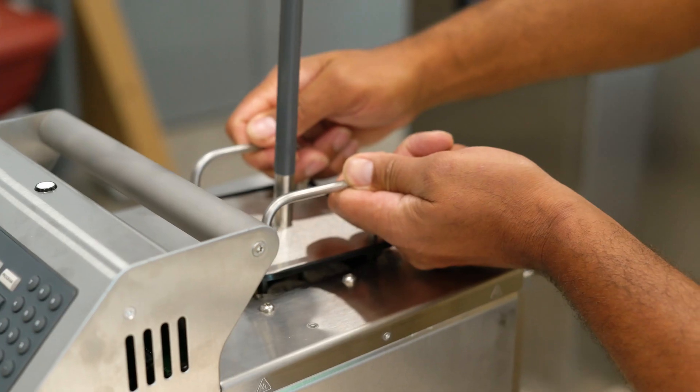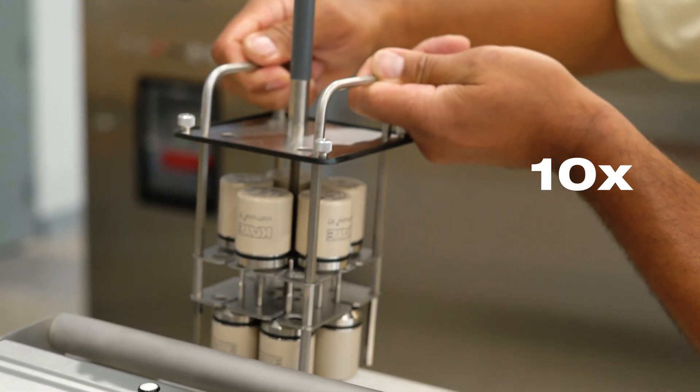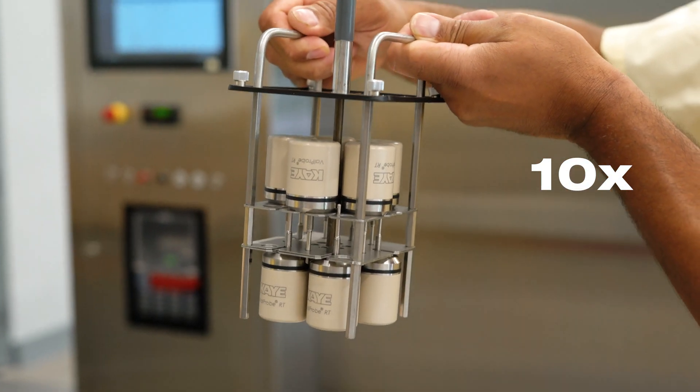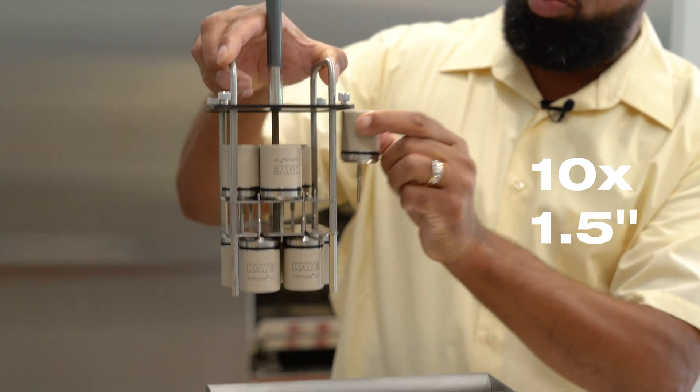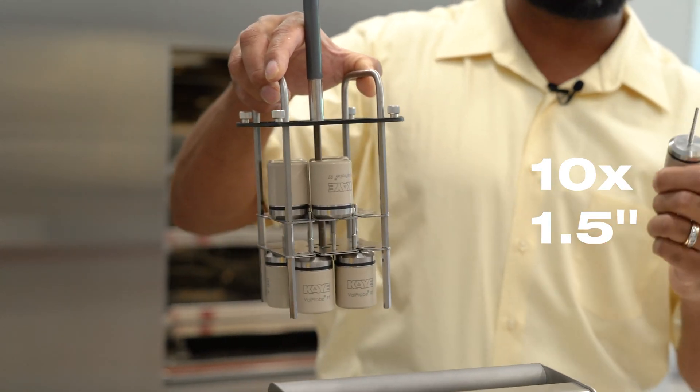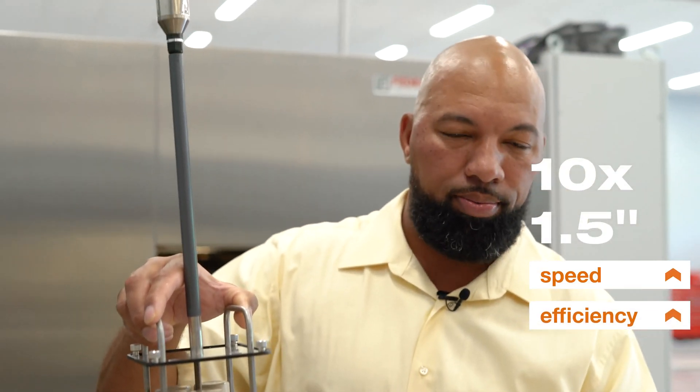This particular bath was designed for ValProbes in mind specifically because you can actually insert 10 ValProbes inside the basket. These are our one and a half inch rigid tip ValProbes, and this bath will allow you to verify 10 at a time, increasing your speed and the efficiency of doing your verifications.